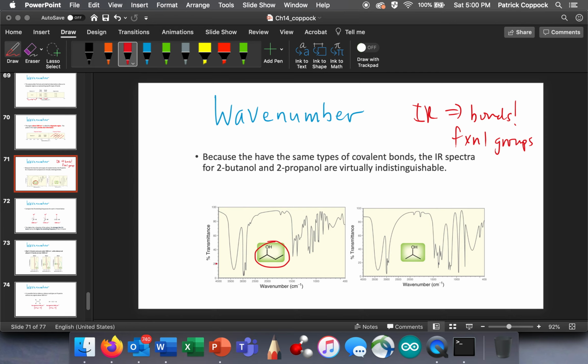This is something that was very uncomfortable for me when I was first learning about spectroscopy. I always thought, all right, I'm given this spectrum, and it has all this information in it, and I'm going to have to be able to label everything and correctly identify the compound. And you're going to find that's not always the case. In fact, it's frequently not the case. Spectra have a very limited amount of information that they can give us.